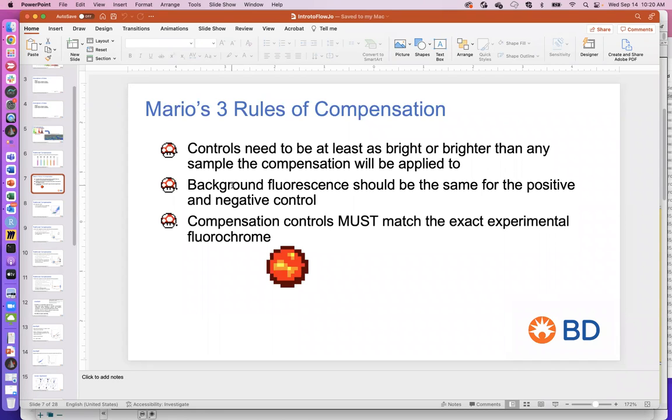And then you also have to have unstained beads for all of the bead colors. Now, normally manufacturers include a negative bead in the positively stained tube. So you normally don't have to worry about carrying around unstained beads. But when you have a mixture of cells and beads, it just means that you have to match cells and beads to each other. And we'll do this in today's session towards the end with compensation.